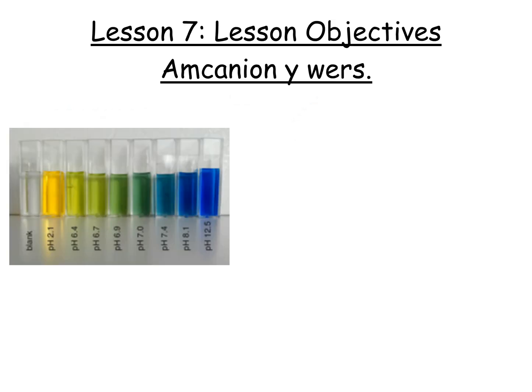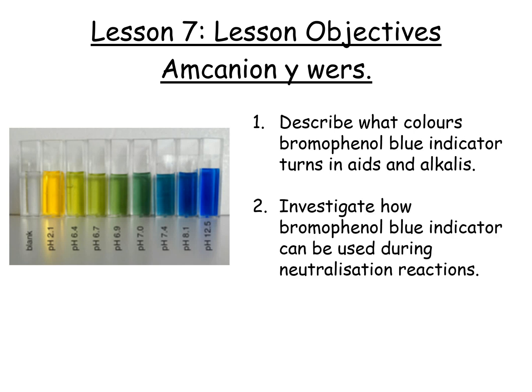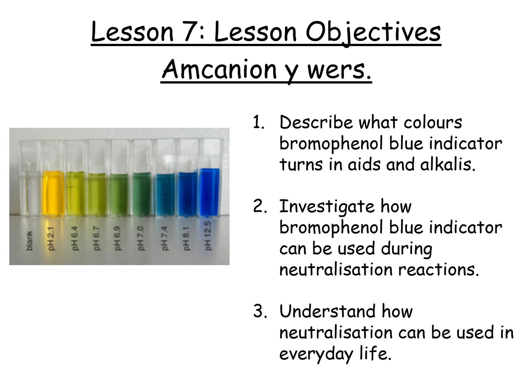So for today's lesson objectives, you're going to describe what colours bromophenol blue indicator turns in acids and alkalis. You're going to investigate how bromophenol blue indicator can be used during neutralization reactions. And you're going to understand how neutralization can be used in everyday life.